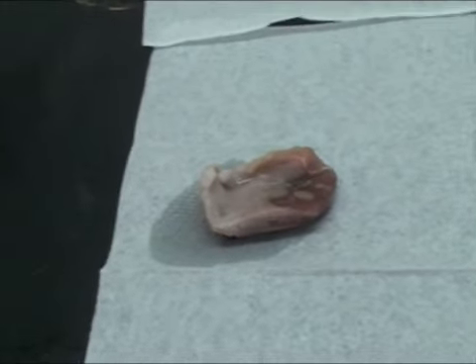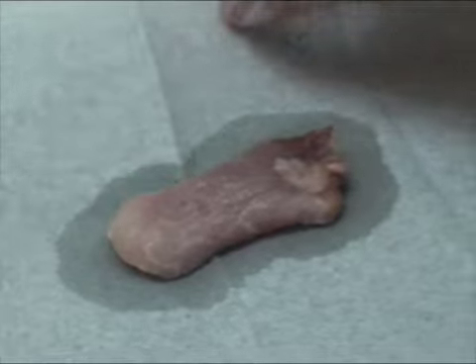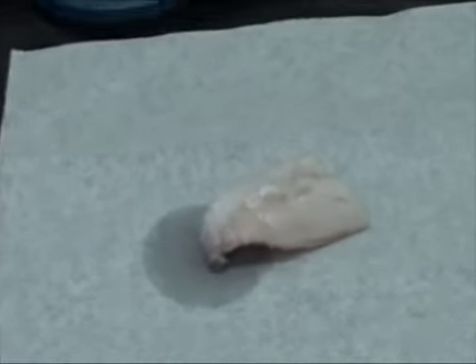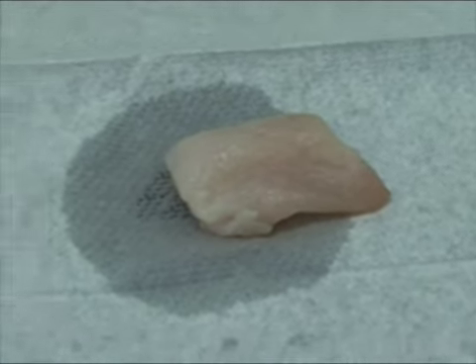We removed all the meats from the beakers. Here is the acid pork. It's a lot wider on the left, which was the side placed in the acid. There's the water pork. It looks fairly similar to how it began with. The acid fish is a lot whiter and shriveled than the water fish.